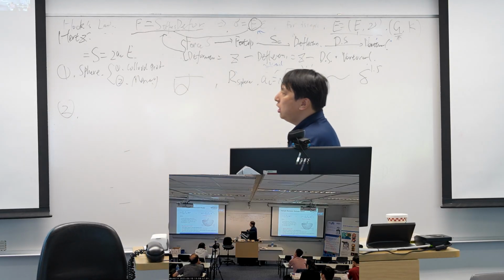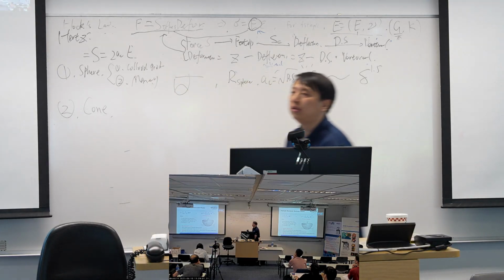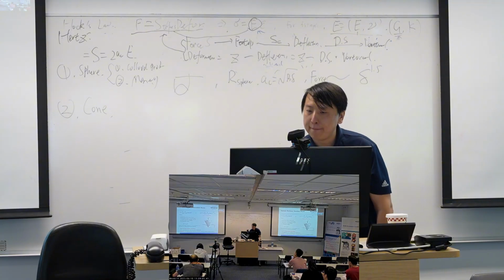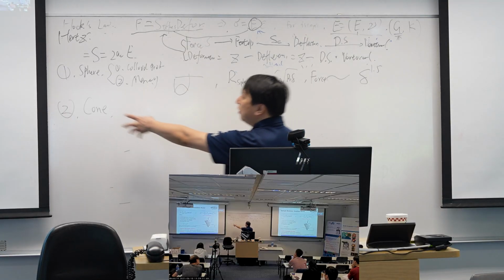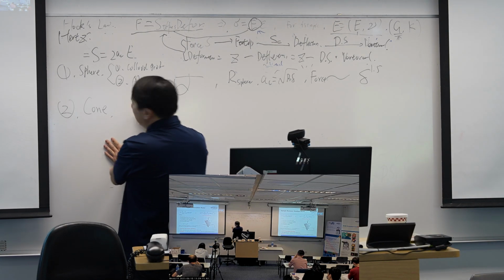Second, if you are using a cone shape probe, that's the AFM probe we are using, then you just use the Sneddon model.